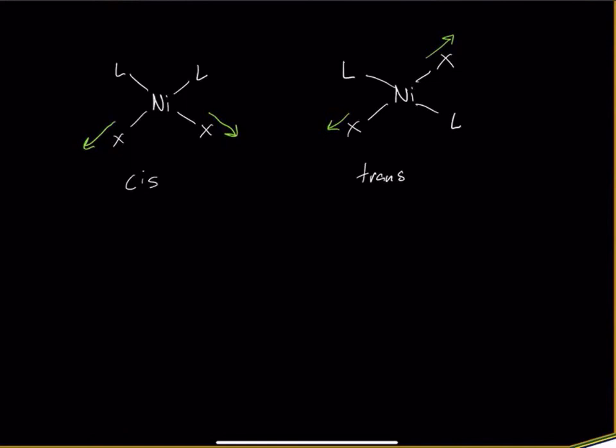So we want to remember the ultimate goal of the lab, what we're doing from kind of beginning to end, is we have these complexes. You're presented with a good bit of data. You have IR data. You're provided with some UV vis data, which we aren't really going to be using right now, and some magnetic susceptibility data. And it's your job to try to craft an argument, right, that assigns a geometry to each one of these nickel complexes. Are they square planar? Are they tetrahedral? How is it that you determine whether something is square planar or tetrahedral?